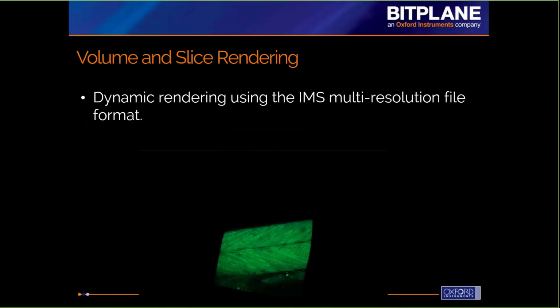render the volume, or to render the portions of the image that we call resolution blocks or texture blocks, to render those portions that are closer to the camera or closer to you at a higher resolution than those that are farther away. So if you have a really big, let's say, whole embryo or whole organ, this makes a lot of sense because there's so much tissue closer to the camera when you're rotating and zooming in, and we want that part, the part that's easier to see, to be at a higher resolution than the parts that are farther away.